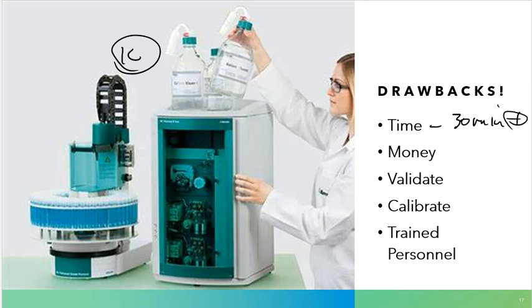Next is money. When I say money, yeah, the instrument, cha-ching, cha-ching, cha-ching, costs quite a bit of money. But a lot of times, all of the components on the inside of this thing are also going to cost quite a bit of money if we're not very careful. So you really do have to make an investment up front. And that investment could be a couple of thousands of dollars that you have to eat through every few months, because some of these are not permanent things that will last forever.